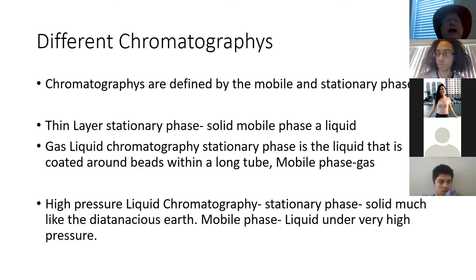It has a stationary phase of a liquid that kind of lines the inside of a big long tube. So you put these molecules, which are made gaseous, through this tube and they dissolve in this liquid for a little bit. But this tube's placed under a high temperature, like 300 or 400 degrees Celsius, and under high gas pressure. The combination of those two things forces these molecules through this long tube.